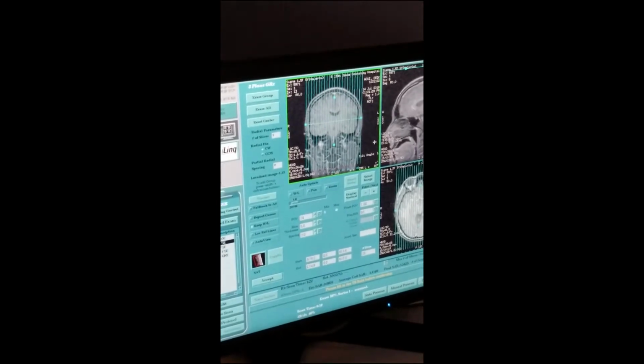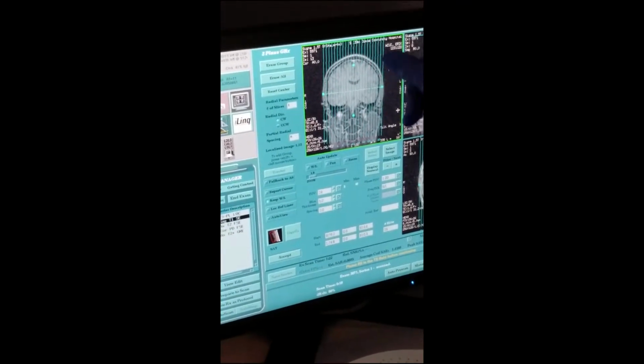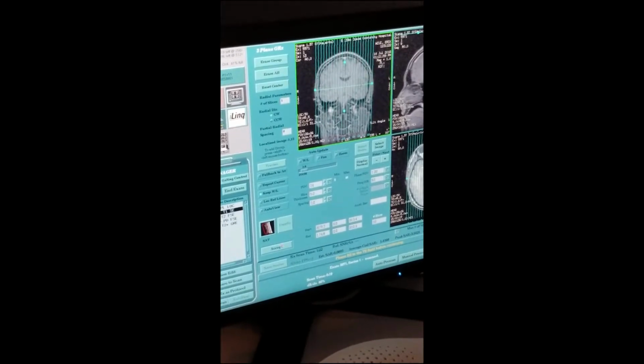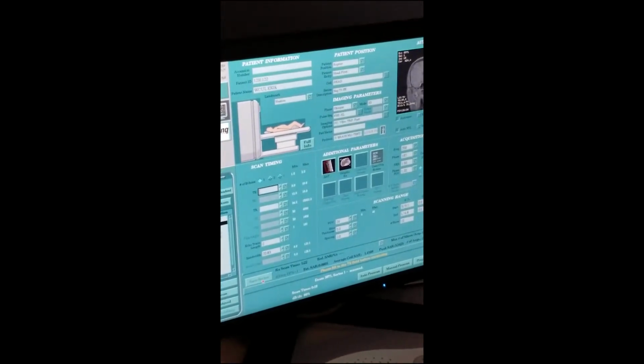If you are happy with that, this is going to be air, but let's just scan because we want you to scan. You're gonna see air. So go ahead. Okay. Take it. It's good. Leave it. Okay. Accept. Now these are parameters.